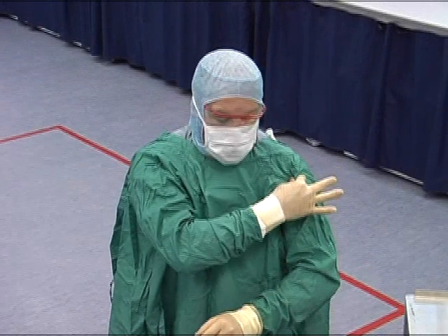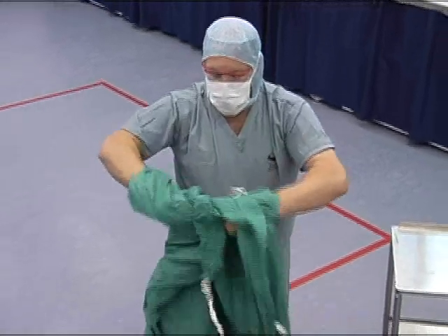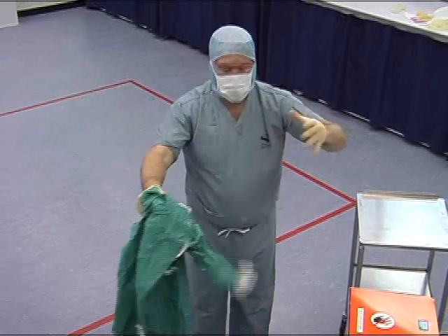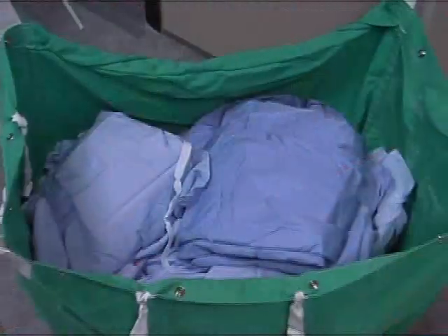Once the ties have been undone, with your right hand hold the left shoulder of the gown and take the right shoulder of the gown with your left hand. Pull the gown forwards, making sure your gloves remain in place. Fold the gown inwards on itself, thus keeping any contaminants contained. Roll up and place in the laundry bag provided.